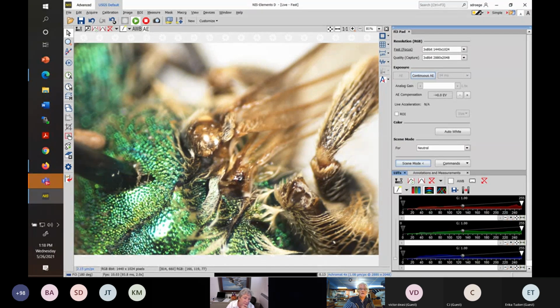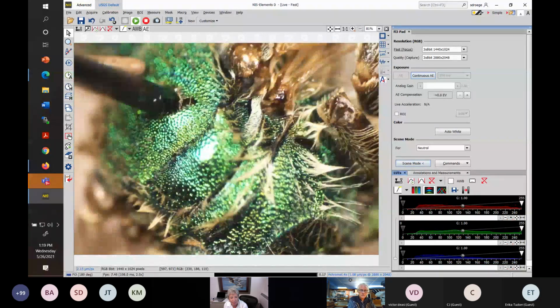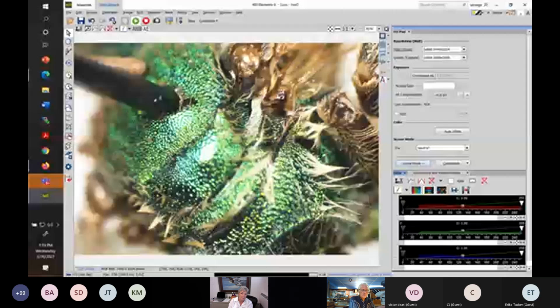It does not have a wing cover or tegula. The next segment down from the scutum is the scutellum. Over here, tucked away, is that axilla. And you see it doesn't stick out anywhere. In fact, it's often difficult to see because it's so innocuous. It's not presenting in any particular way. This next segment down is the metanotum.